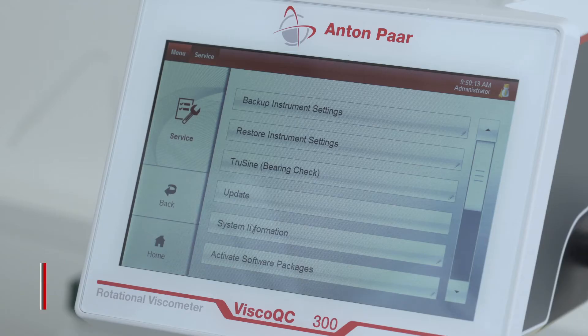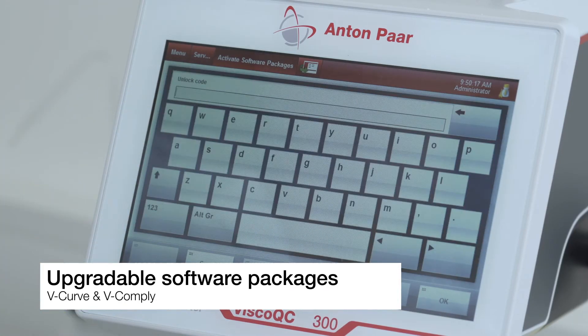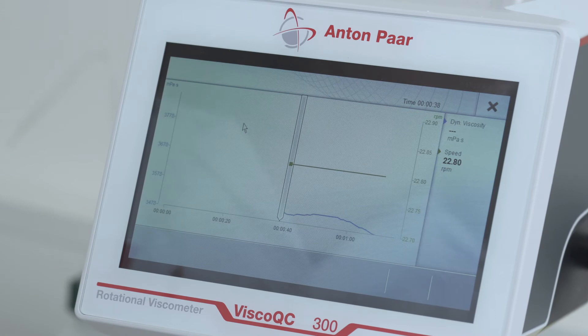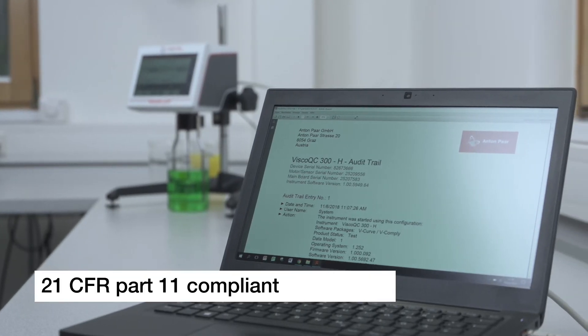By entering an unlock code, additional software features can be added to Visco QC. Up to two software packages are available: graph and analysis functionalities, or compliance software features to fulfill all regulations of 21 CFR Part 11.